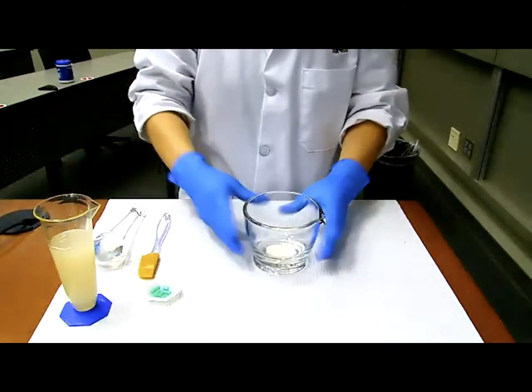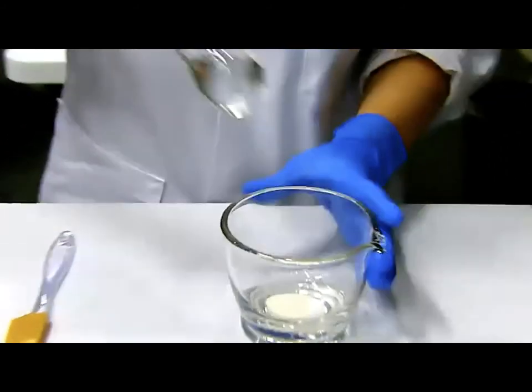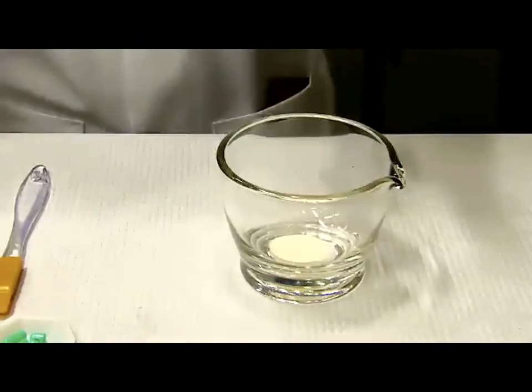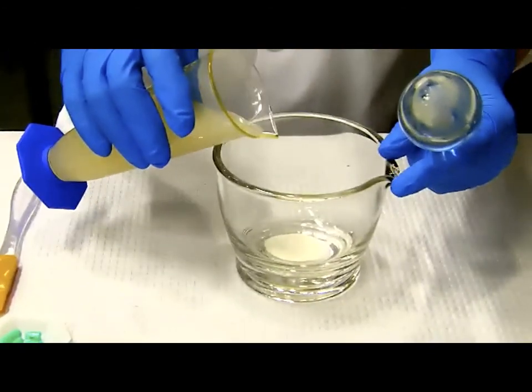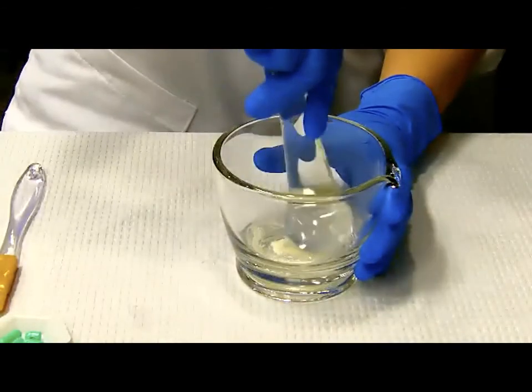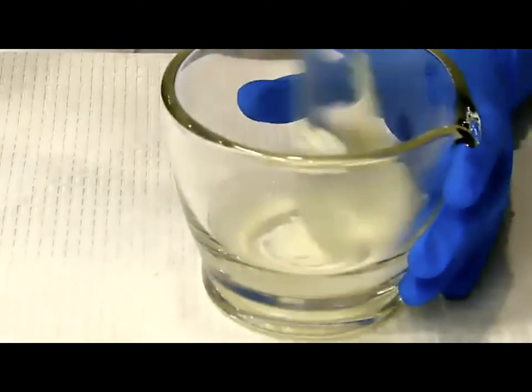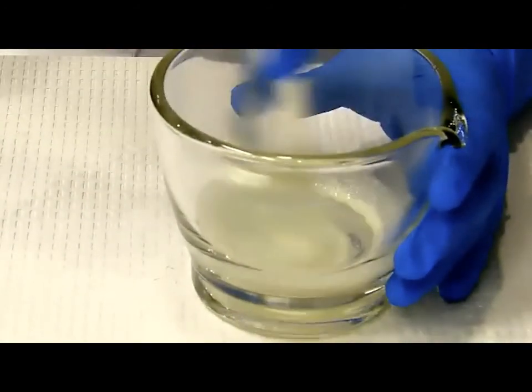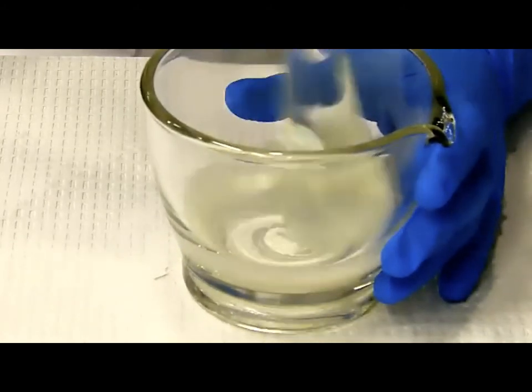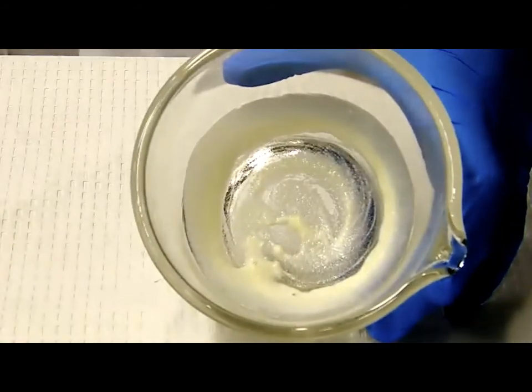Okay, so we have gathered our powder on the bottom of the mortar. What I want to do now is use my pestle to make a little dip, and now add a small amount of oral blend. My goal is to make a very uniform paste. So let me do this. Okay, that looks really good, a uniform paste has formed over there.